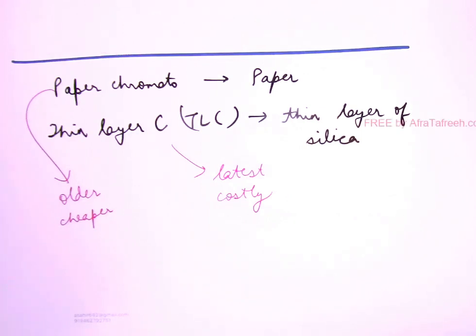So let's see this common principle of paper chromatography and TLC. Now, first we will take the stationary phase, either paper or thin layer of silica, whatever.